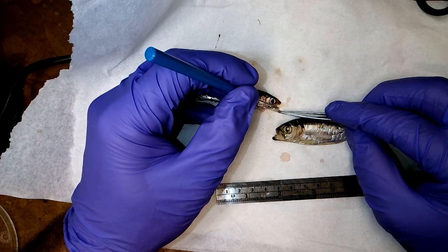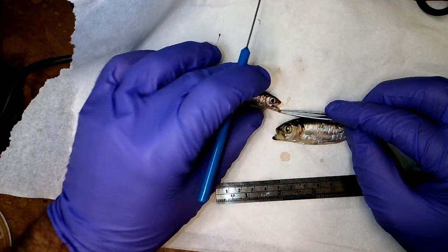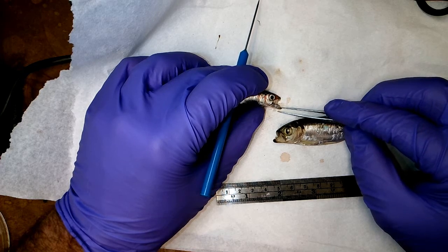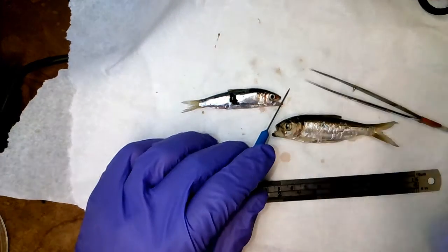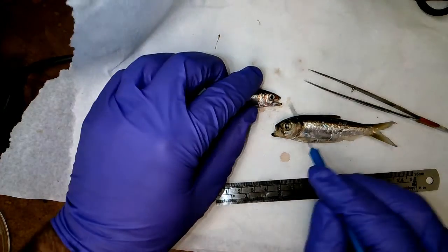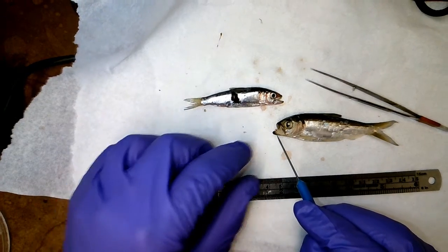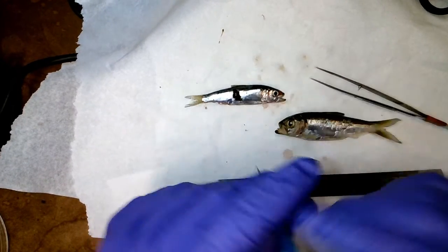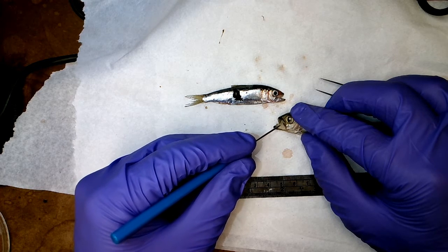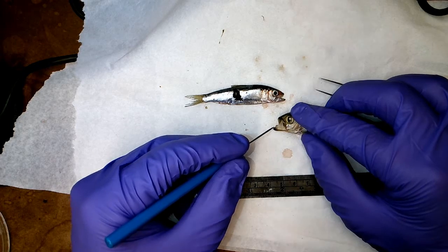It's just kind of sticking to the lower jaw. So when the mouth is open, this tongue is quite visible. Okay, you can just see it at the tip of my forceps there. Okay, so you're looking for that protruding. And then, again, D is the steepness of the lower mandible, the lower jaw, where we have a relatively flat lower jaw here. And then you have what we're describing as a shovel coming down on this herring. So hopefully folks can see that.